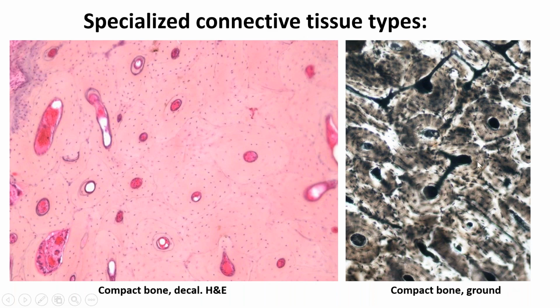We see the round structures here. So we see the osteons, the functional unit. In the center, we're going to see the Haversian canals. And of course, we're going to see the Volkmann's canals right here. I can see these same structures over here. I can see the Volkmann's canals over here and over here. I can see the central Haversian canal, and I can make out that round target that I saw, that is the osteon or the Haversian system.